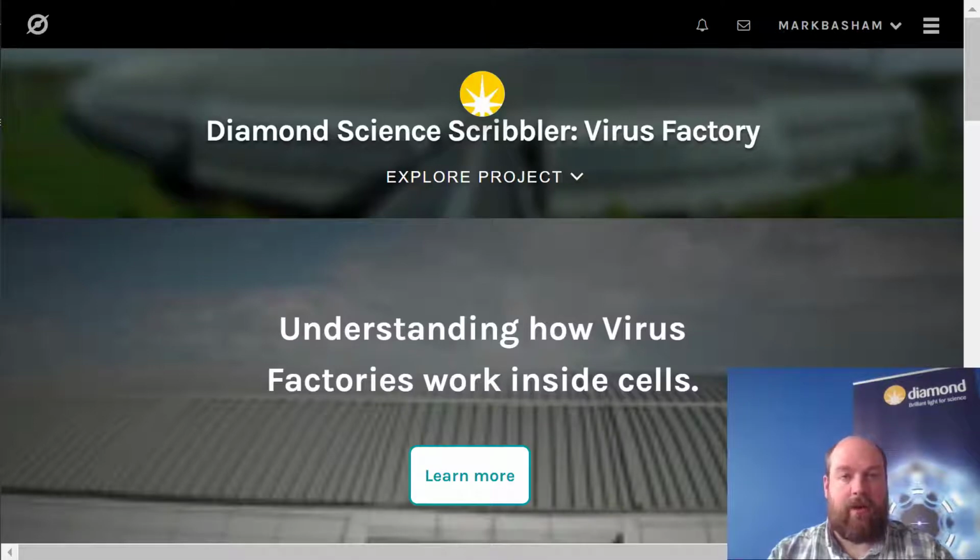This specific one, we're working with data that was collected from the EBIC facility at Diamond Light Source, and they've done very high resolution images using an electron microscope of viruses infecting a cell. And what we're interested in is where those viruses are in relation to the rest of the cell, and also what stage they're at in their virus life cycle.